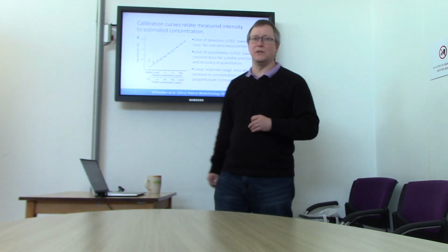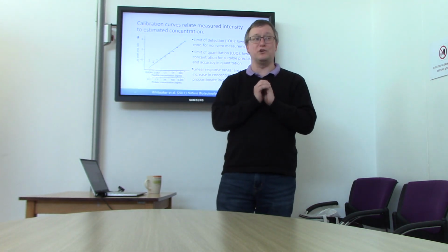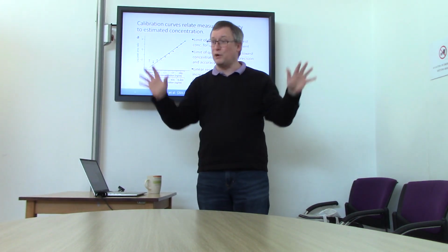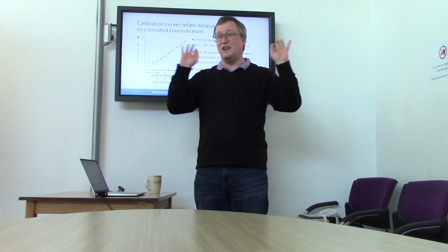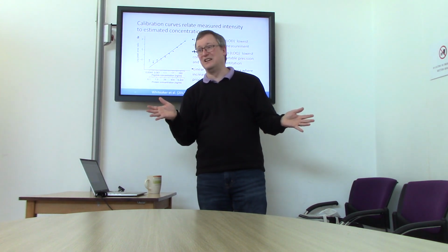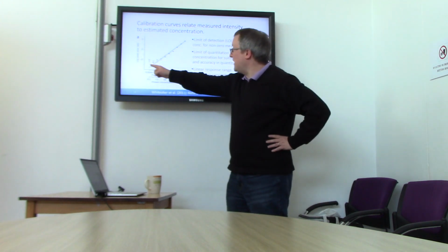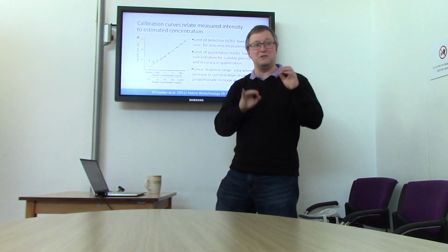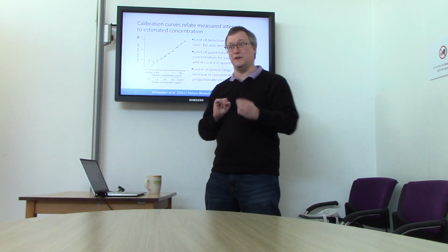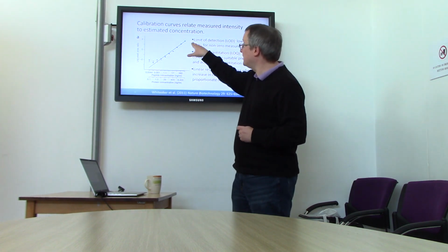Okay, on we go. Calibration curves are very, very important if you're talking about quantitation. Now remember, I've already said that in looking for proteomic differences, you may simply be asking what changed and in which direction. In a case like that, you're not really quantifying. You're just asking, did it go up or did it go down? That's hardly quantification. But it might be that you have an experiment where you need to be able to accurately quantify exactly how much this protein has risen or fallen.